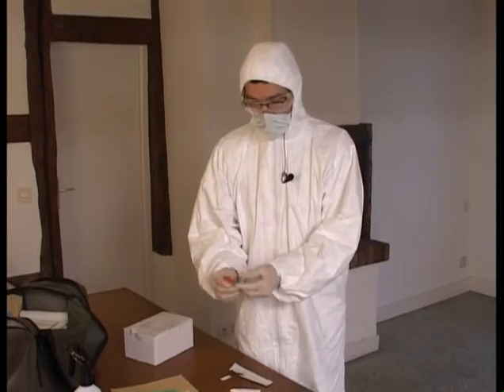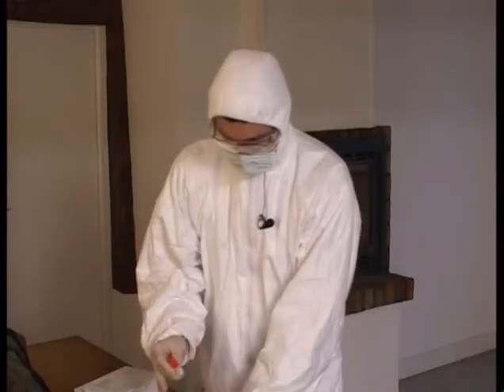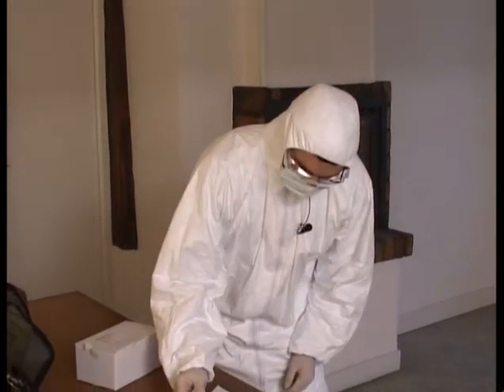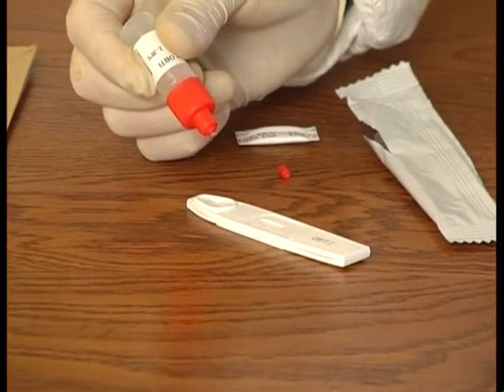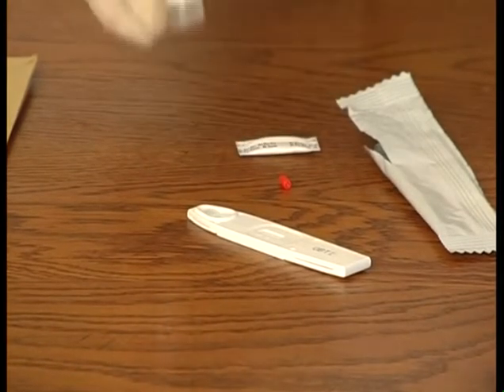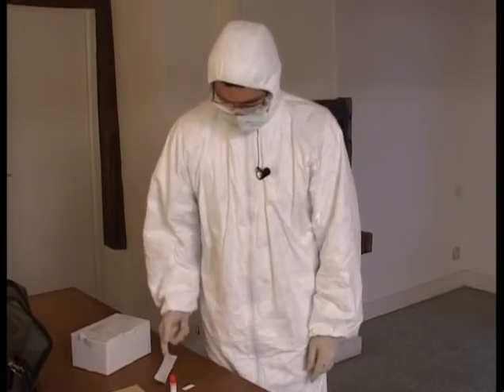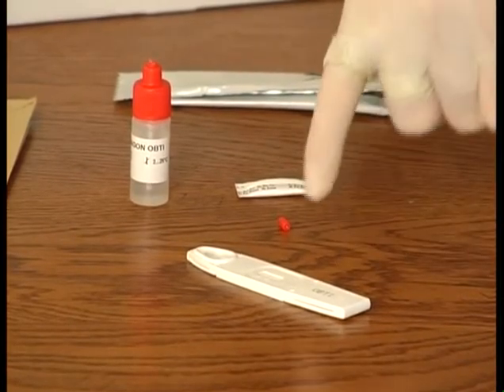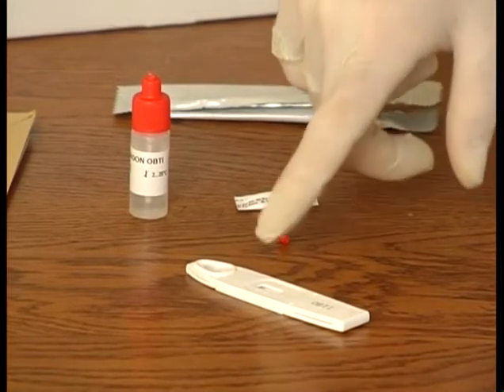Just break the red end of the sampling tube, which is designed for this. The unit is homogeneous. We place exactly two drops of the carrier liquid in the round zone marked with an S. The solution will then migrate on a tongue located in this plastic medium. We can see it migrating.